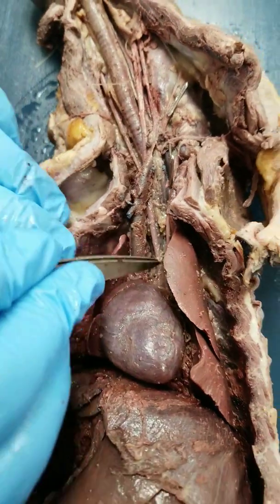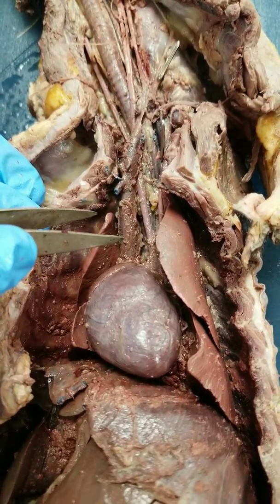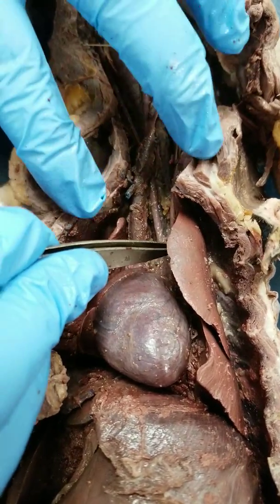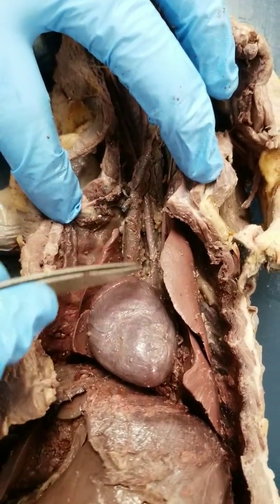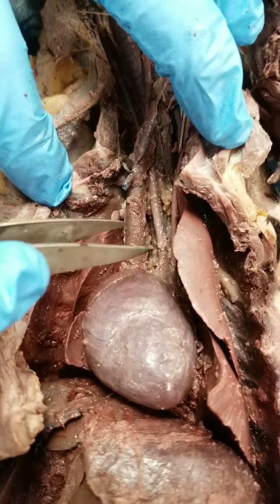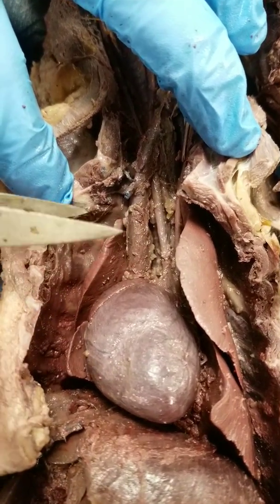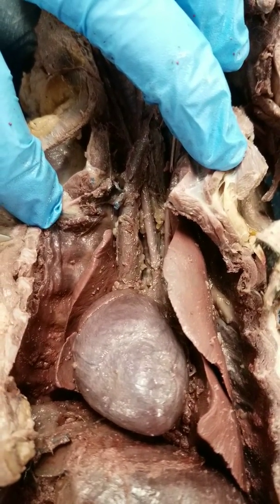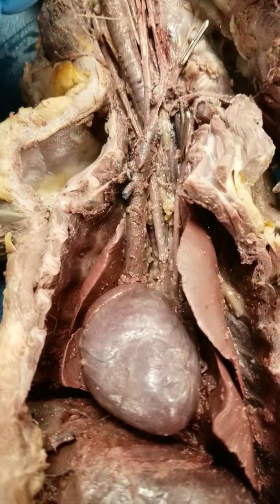You will also see the thymus gland sitting here, which I have removed. It will be kind of a darkish brown color, about the size of your thumb. It's going to be sitting on top of these blood vessels and part of the heart in between the lungs. You're going to remove that with your tweezers and maybe a probe. Be careful because these blood vessels may want to come with it — you don't want to take these out. It says in your lab manual to remove it. You're not tested on the thymus, but you need to remove it so you can see all the blood vessels.